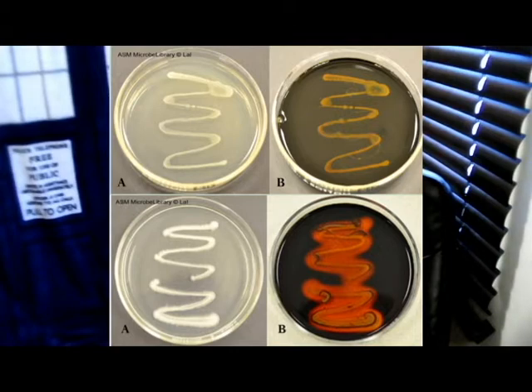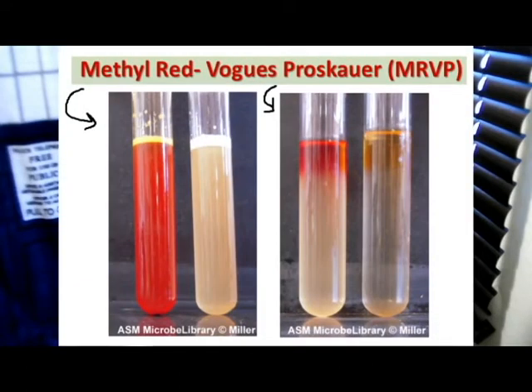We'll start with the MRVP, which is, as you remember, you prepared 4 tubes exactly the same. The difference was that you inoculated with 2 different bacteria. So you need to do your studying on what the different tests are used for, the MR and the VP.